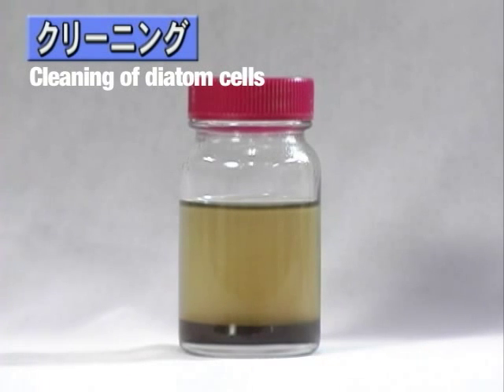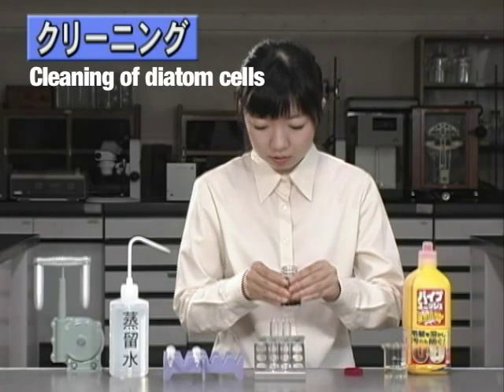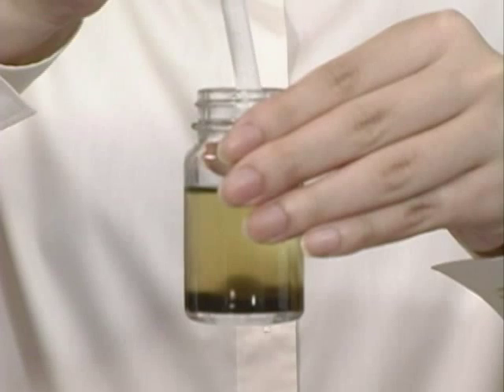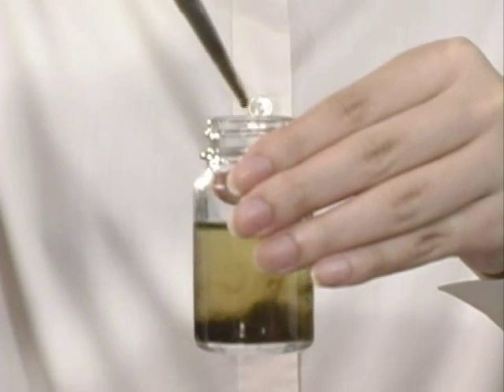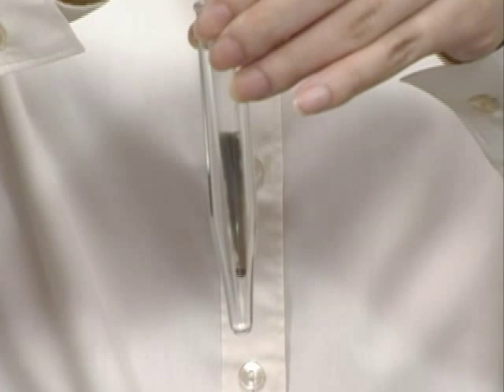We will first demonstrate the cleaning process using the collected diatom sample. Using a pipette, we take a sample from the bottom of the vial. Next, we place this sample into a centrifuge tube.